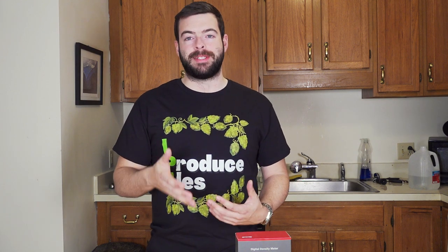Who exactly is Anton Parr? Anton Parr is an Austrian lab equipment manufacturer that does a lot of business making high-precision lab equipment for things like hospitals and chemistry labs. Their specialty is in density measurement, and that is what this does. And if you're not already aware, when you're measuring specific gravity of a liquid, that is actually a form of density.